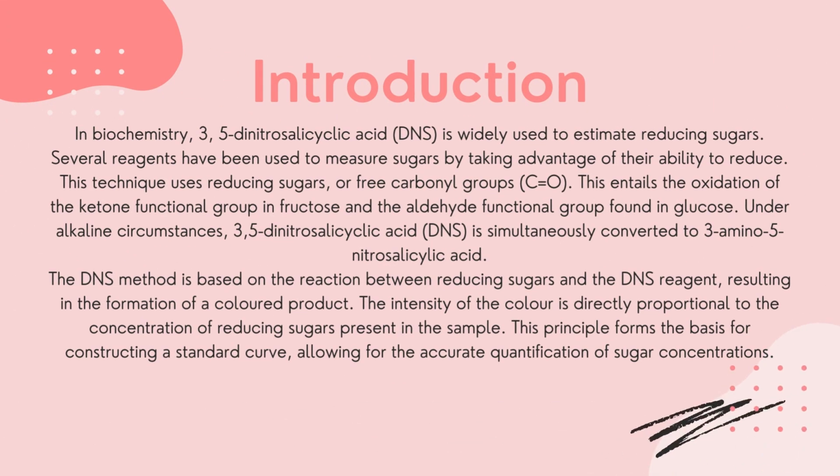Introduction. In biochemistry, 3,5-dinitrosalicylic acid (DNS) is widely used to estimate reducing sugars. Several reagents have been used to measure sugars by taking advantage of their ability to reduce. This technique uses reducing sugars with free carbonyl groups, C=O. This entails the oxidation of the ketone functional group in fructose and the aldehyde functional group found in glucose.